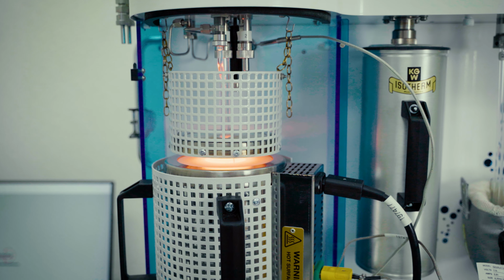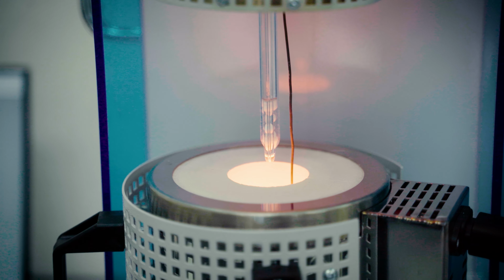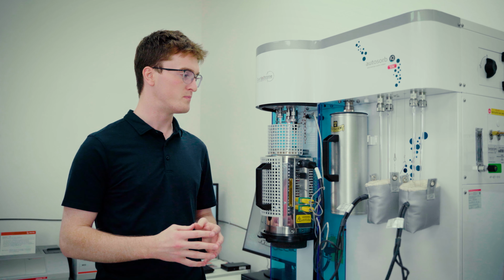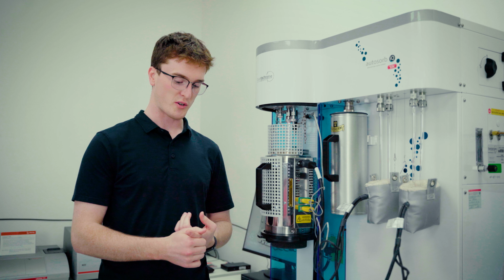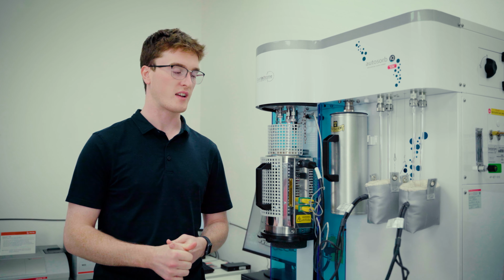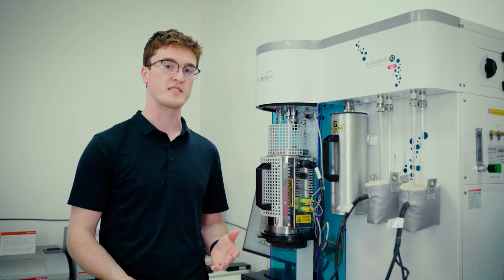In this specific case of an automotive three-way catalyst, we have various platinum group metals present, which interact with different gases under different conditions, all coming through the exhaust pipe, to reduce those to more environmentally friendly forms. So using the same instrument and consecutive analyses, we were able to perform different tests to get the oxygen storage characteristics, the metal dispersion, and surface site density. It's also capable of looking at things like water vapor adsorption uptake, carbon dioxide storage, carbon monoxide interactions, nitrous oxides, and various other interactions that can give you insight into these properties.